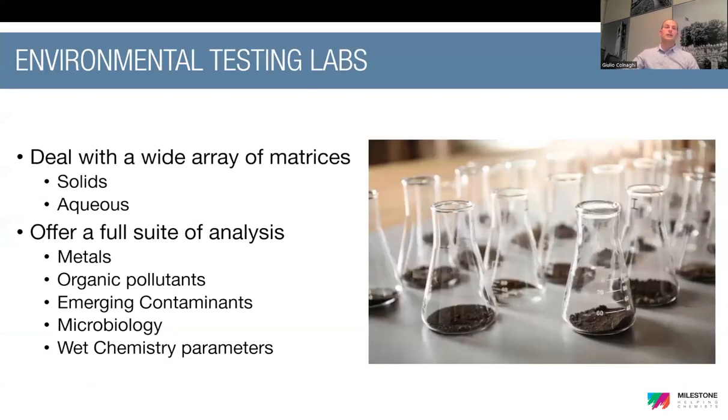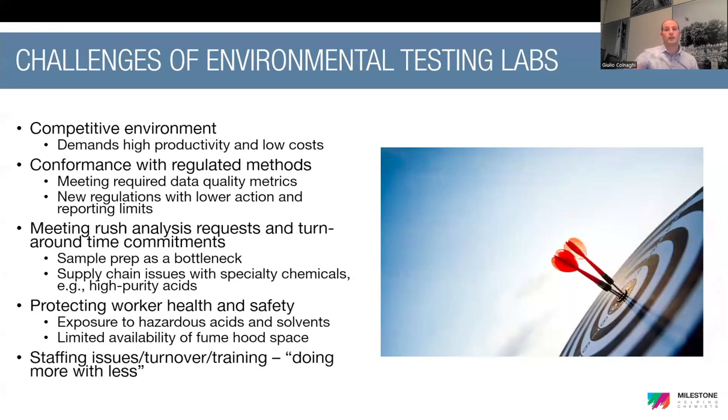So when we consider an environmental testing lab, we know that it is dealing with different kinds of samples, both solid and aqueous, such as wastewater, but also soil, sediments, and many other matrices. At the same time, the lab offers a full suite of analyses: metal testing, organic pollutant determination, emerging contaminants, microbiology, and even wet chemistry parameters. So the lab has to offer all these solutions, but also has to consider a lot of different challenges.